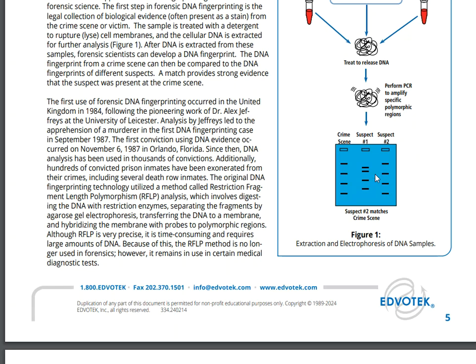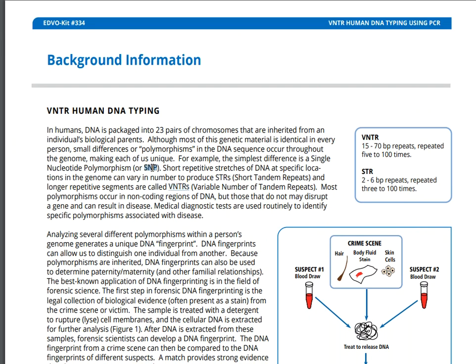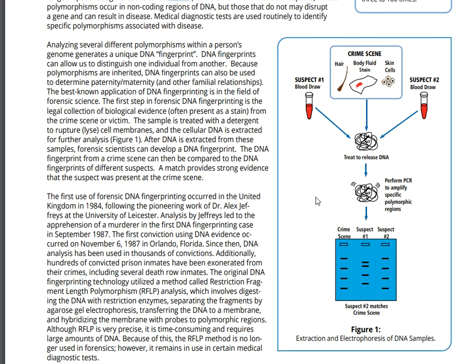That suspect will also have polymorphisms in their DNA. And once more, just as before, they're either going to be the SNPs, or the STRs, or the VNTRs. And those will show up in a different way in different locations with different base pair fragment bands that begin to happen. And that banding will look different because of that.